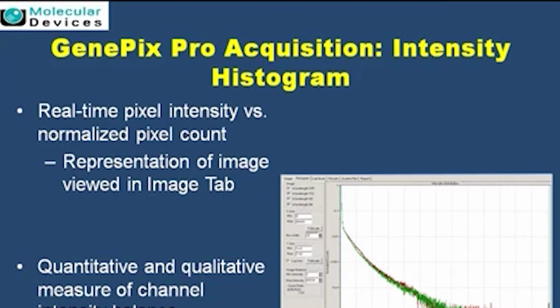That's right. So once you are able to do that, you can see and select whether yes, this PMT is good for me. This is a way you check which PMT is more suitable. So you select a PMT, look at it, and see the overlap. Wherever there is the best overlap without saturation, you want to go with those settings.